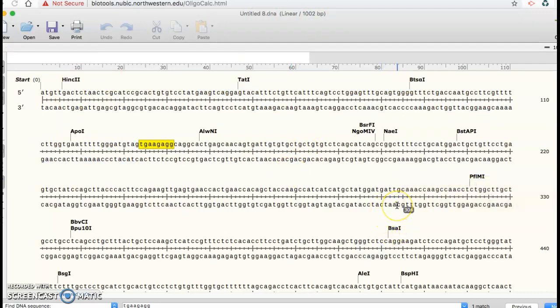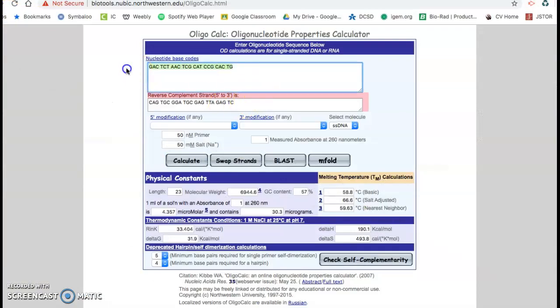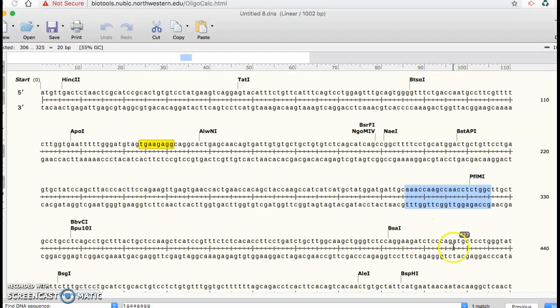The most Sanger sequencing can do is about 1,000 base pairs. So I would just start maybe designing right back here. Now reverse primers are a little bit more tricky, right? So I'm just going to grab somewhere around here and get like 20 bases, right? And I'm going to hit copy, and then I'm going to go back up to here, and I'm going to hit paste, right? So it starts with AAA, and you guys can see if I go back to my SnapGene here, it thinks what I want is this 5 to 3 prime direction, this AAA.